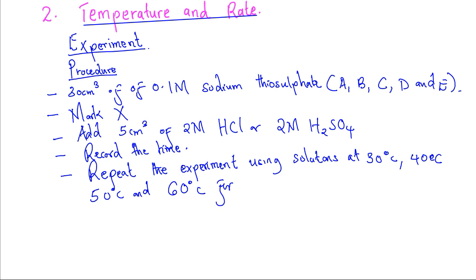That is for B, C, D, and E respectively. Record your results as shown in the table below.